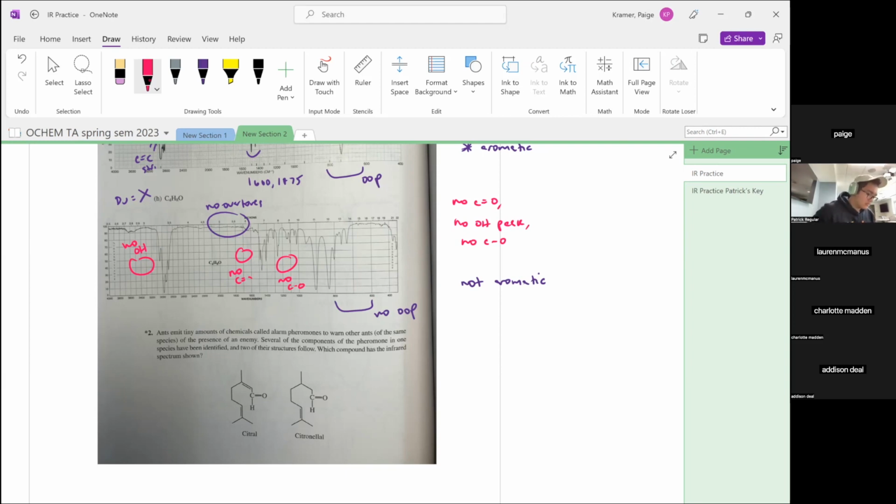If we were actually given this without a molecular formula, it's not really following our regular progression. If we were giving this to you on a test, we would probably have you call this a hydrocarbon, because you'd probably be given percent carbon, percent hydrogen, and then you would continue like that. So some of these are a little confusing. This was taken from a textbook that is above our class.